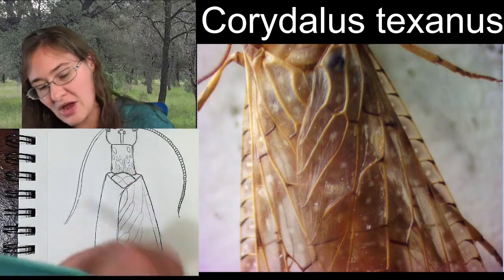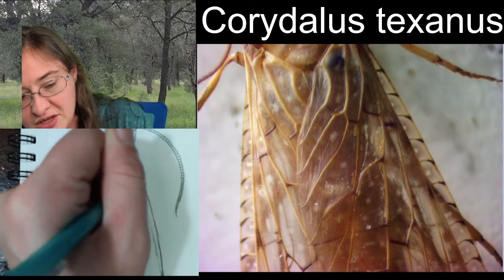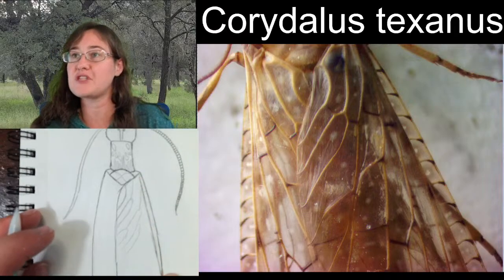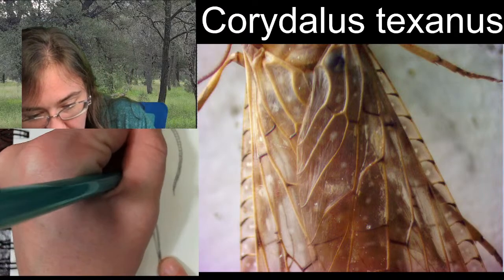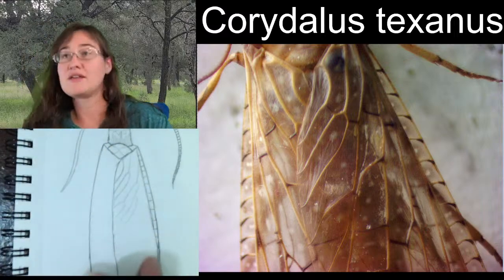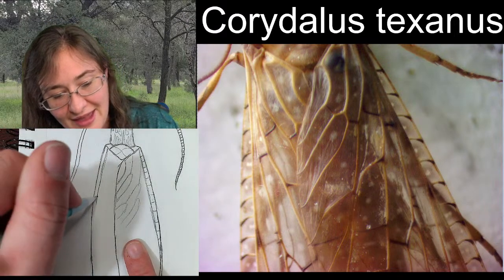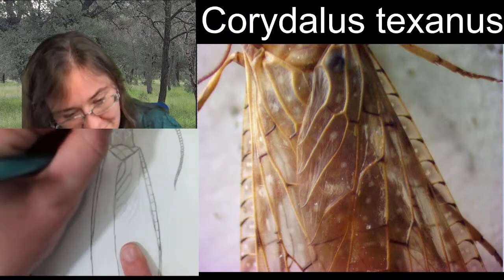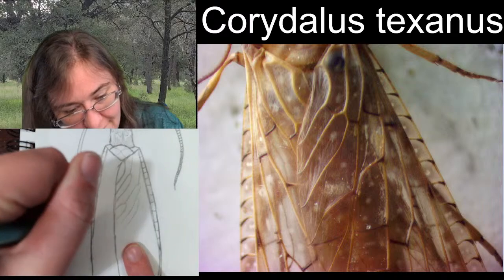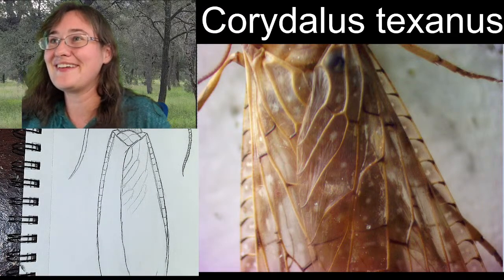So this is how I'm going to get those side in. I'm going to take this angle from here, and I'm just going to angle off this piece right here, and then I'm going to break out, like this, on both sides. Ideally, evenly. That's actually really nice looking. Okay, cool.